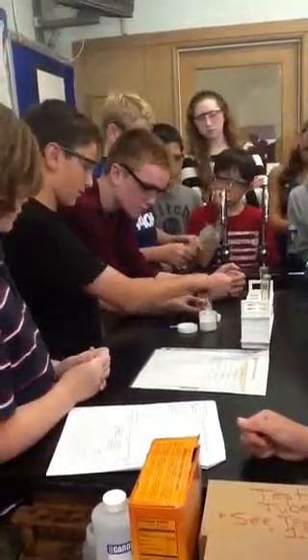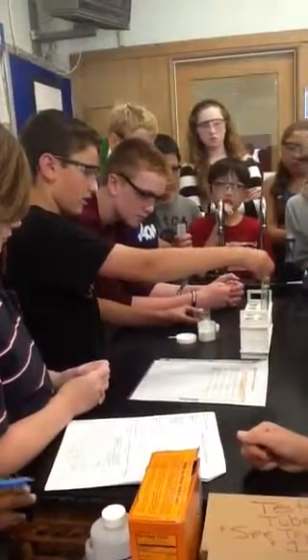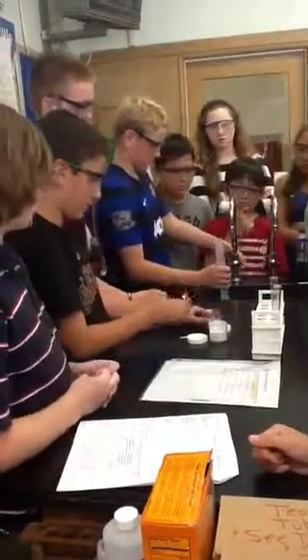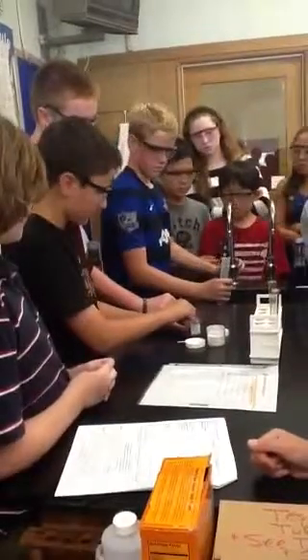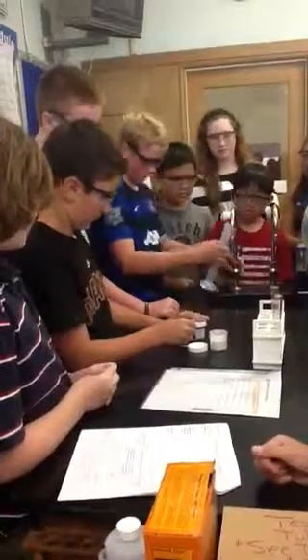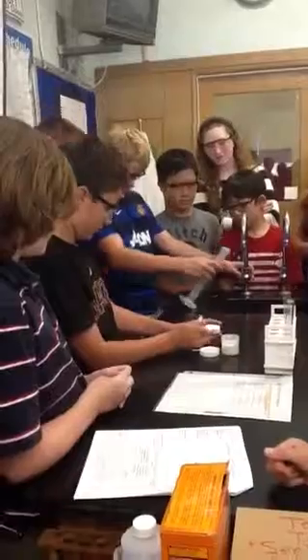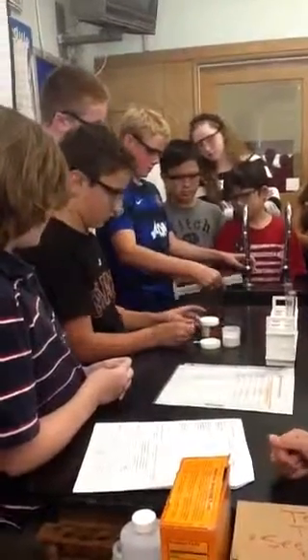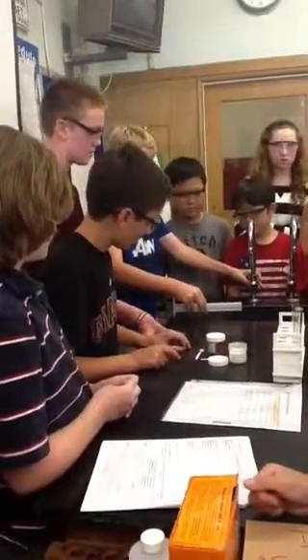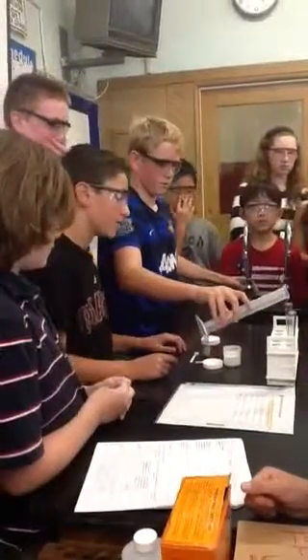Yes. Okay. So first you have to put a lab scoop of substance E. And Nick's going to measure out 10 milliliters of water. You can cap it. I think you're done. Just water? Let's just leave it. It always falls. Okay. Do I have my goggles? Use my goggles.